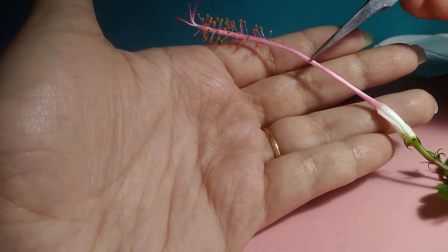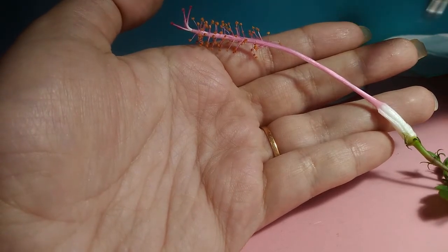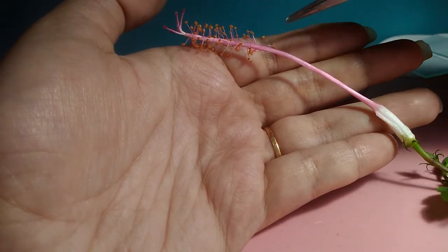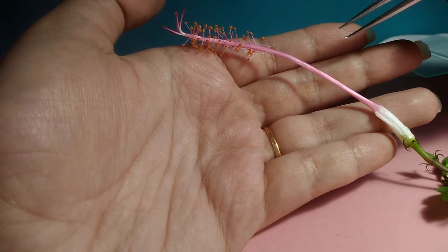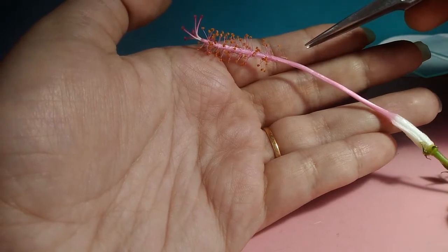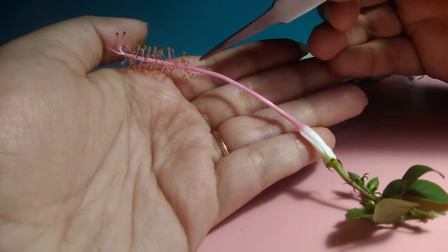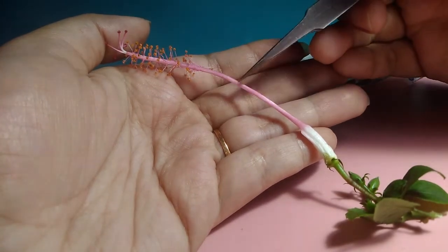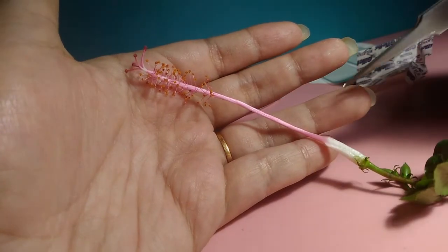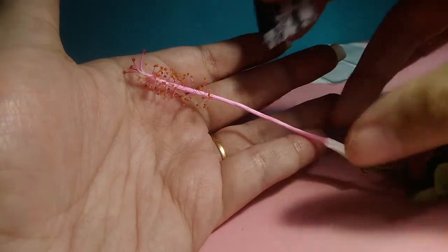Now some of you might think that this is the style of the flower, but no, this is not the style. In hibiscus, this is not the style. In other cases, it could be, but in hibiscus, it is not. Why? Because in hibiscus, we have a condition which is known as the epipetalous condition, and this is a monadelphous stamen. What does that mean? Monadelphous stamen means that the filaments of our stamens are all joined together to form this sheath, this tube-like structure. So now our job is to cut open this tube to expose the female reproductive part or the pistil.